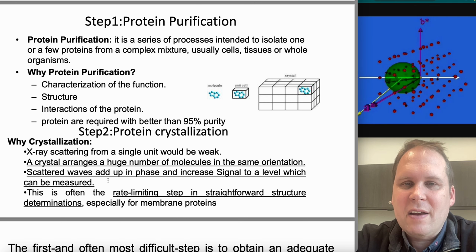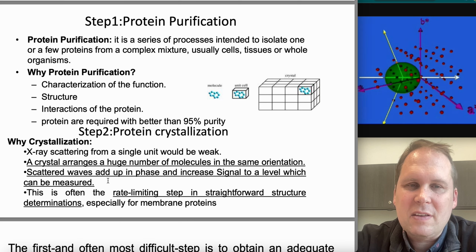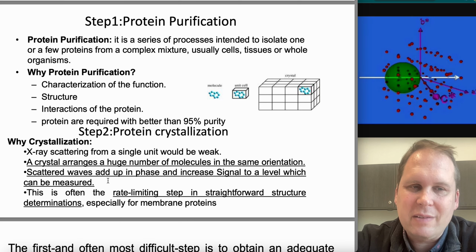This is the stage where most proteins fail. They either don't express well or they do not purify well.